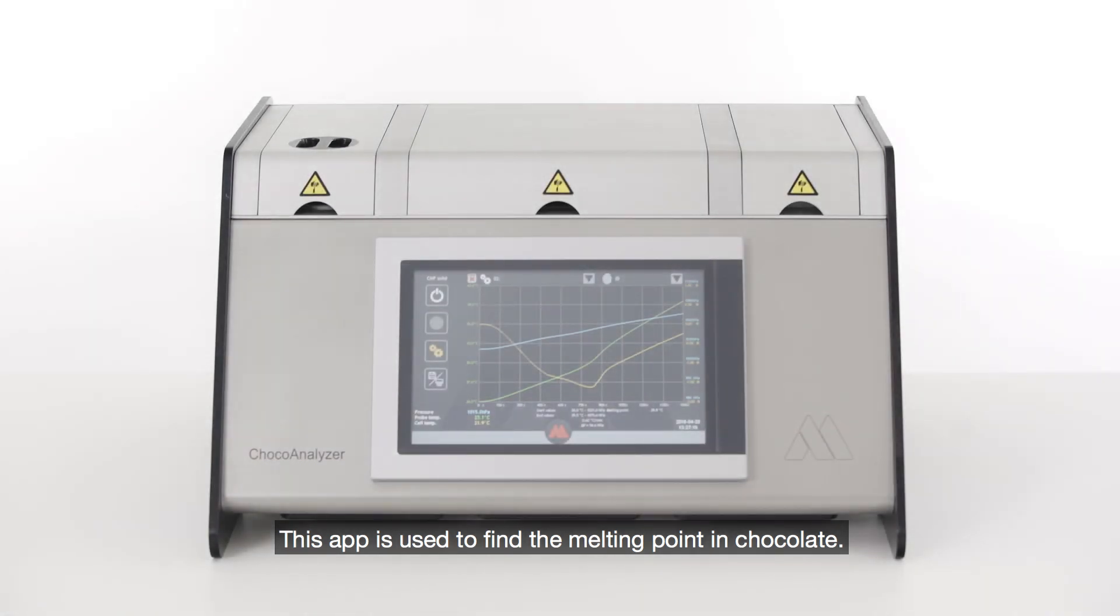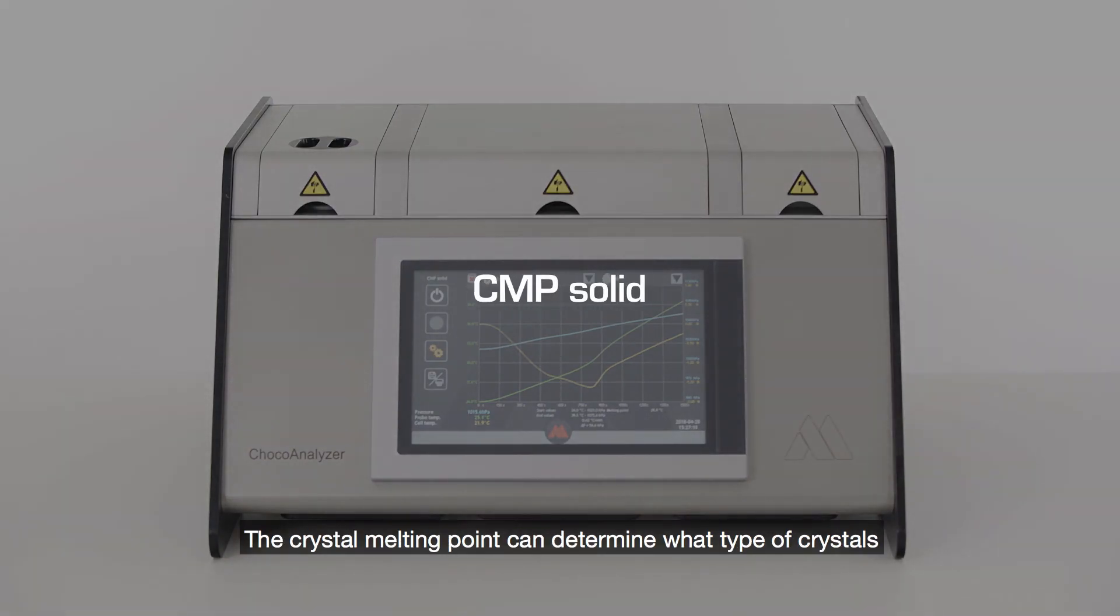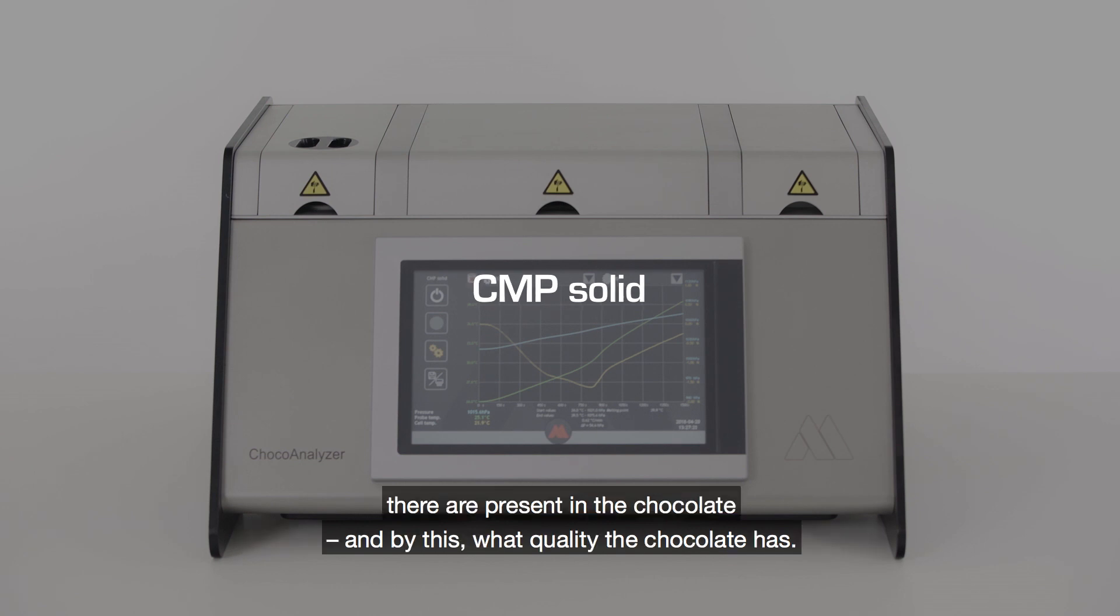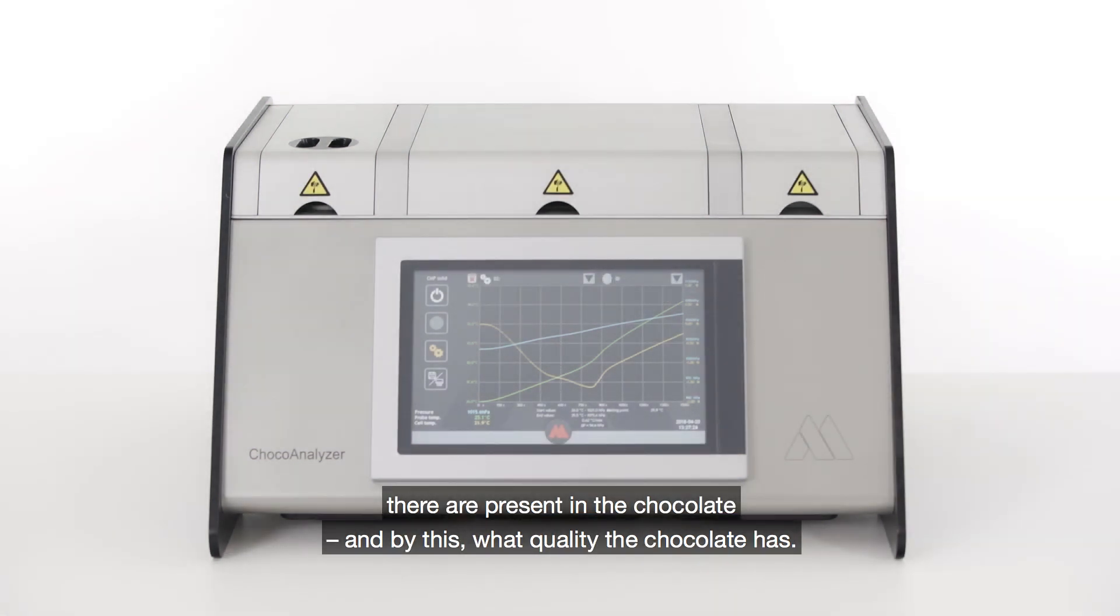This app is used to find the melting point in chocolate. The crystal melting point can determine what type of crystals are present in the chocolate and by this, what quality the chocolate has.